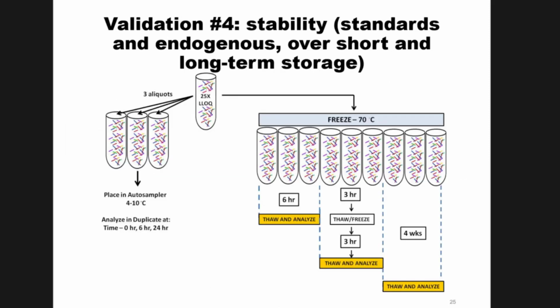The fourth is stability, and I know Andy talked about this a little bit before. This is the one where maybe you would take your sample, in one experiment, and just put it in your autosampler and measure it on different days. Is the peptide target degrading in the sample? Is it adhering to the plastic or something? And then you would also do a freeze thaw test.